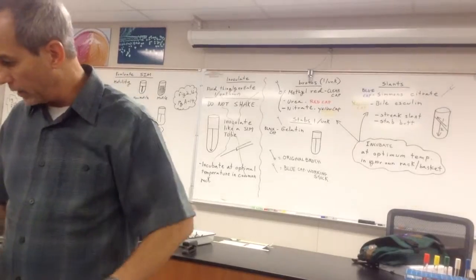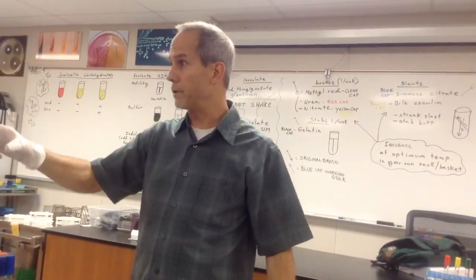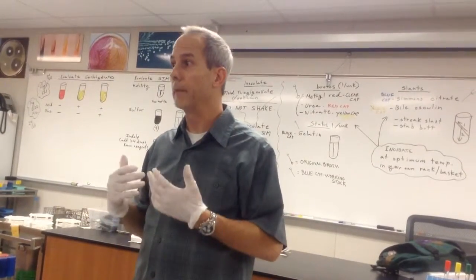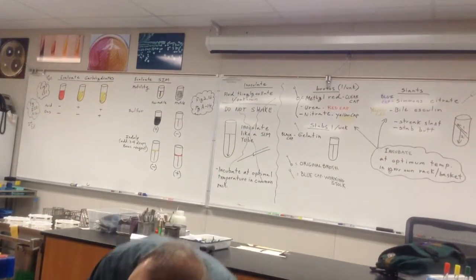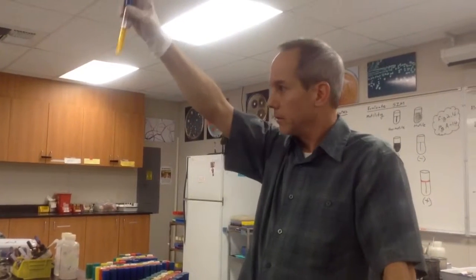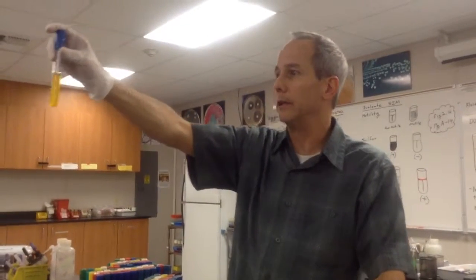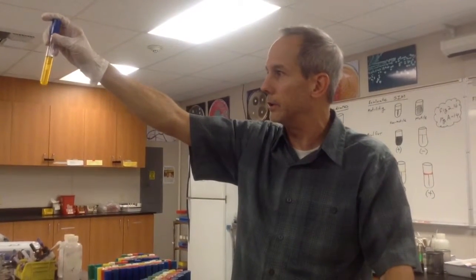There's a second thing you look at in here. Do you remember the tube that's turned upside down? Durham. It is a Durham tube, and it's turned upside down to trap gas. So let me give you a shining example. What a shining example of a Durham tube that has trapped gas in it. Do you see that? Okay? So that's why this is positive for waste products, positive for gas. You see, look at that gigantic air bubble in there. Do you see that?